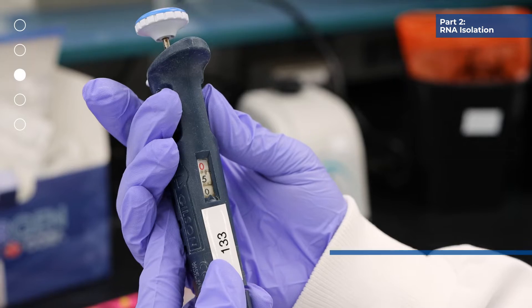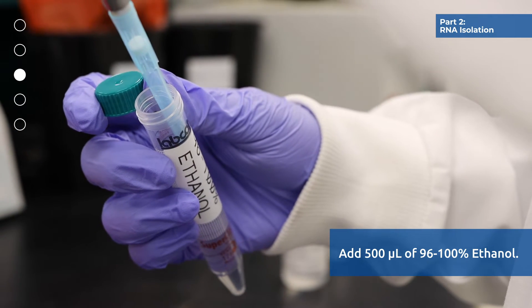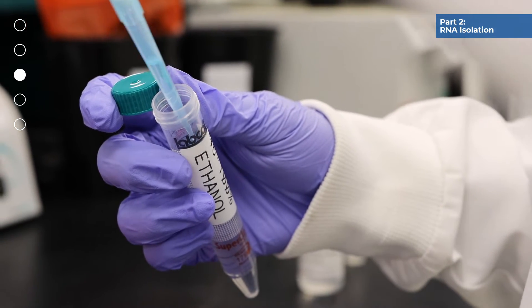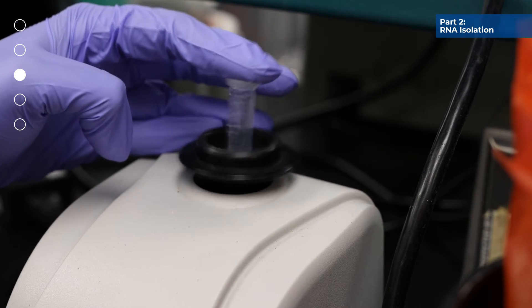After incubation, add 500 microliters of 96 to 100% ethanol to the mixture from step 2 and mix well by vortexing for 10 seconds.